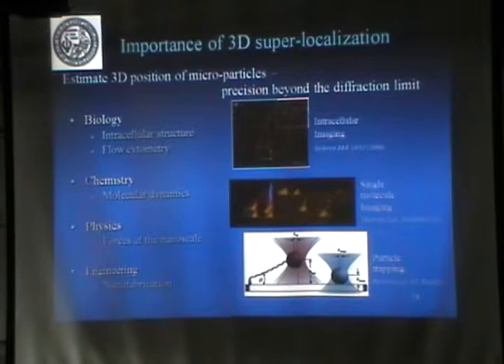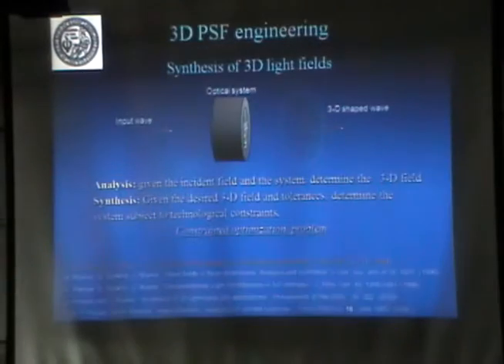So this is a bit more general than resolution. It's about localization of the particles. It's been used before these super resolution microscopies to measure forces in biophysics, tracking particles, and flow. You measure the flow in fluids, right? You have a lot of particles, you look at the position of particles. So it has application in biology, in physics, chemistry, for nanofabrication also. So it's a bit more general.